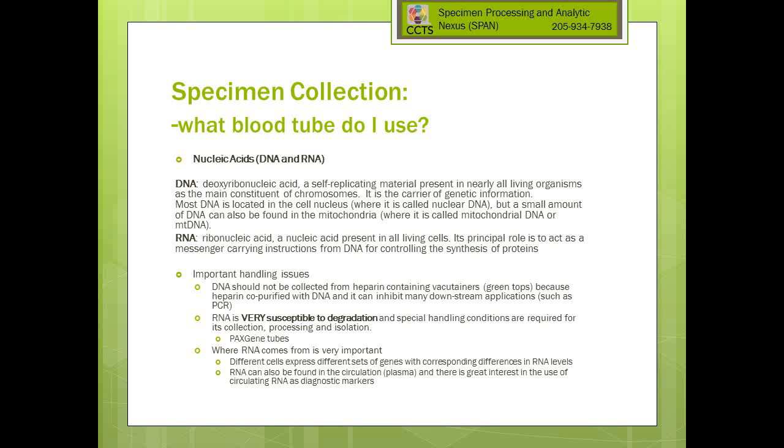But again, a lot of technical details go into that. So those RNAs, those plasmas need to be worked up immediately. So they actually had coordinators in the clinic at TKC. We were right there at the bedside or on the table side getting blood, running it over to the lab. We were spinning it down immediately. When you're doing RNA from plasma, it's not a standard centrifugation step. We'll talk about centrifugation in a few minutes. You need to make sure you get rid of all the cells. You only want RNA from plasma, but it can be done. And when they're worked up quickly and stabilized, you can get good results.